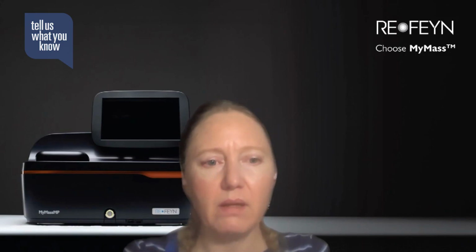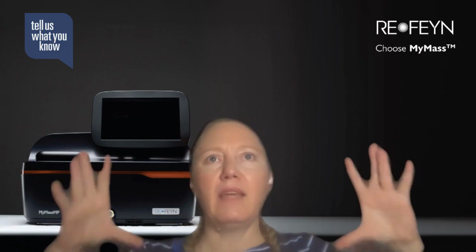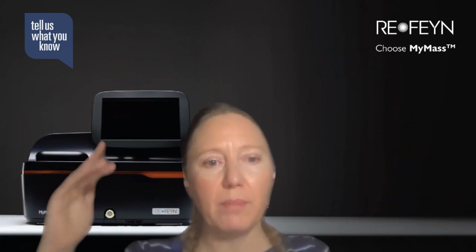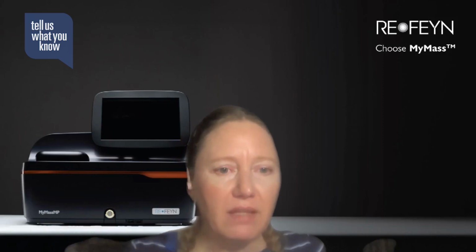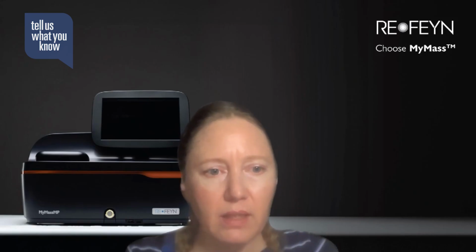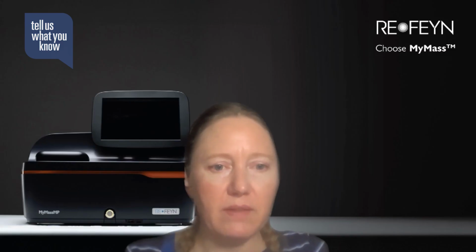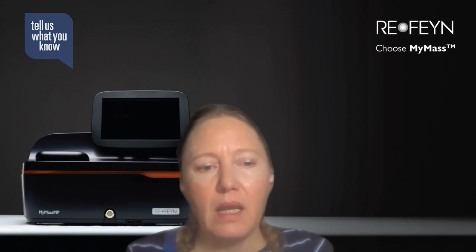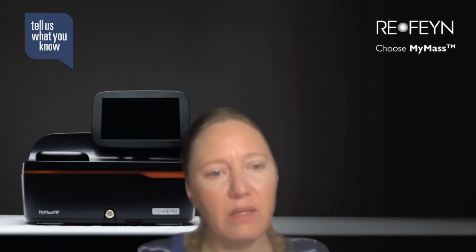So I think this is where fast, low sample consumption experimental checks become really important. So AI can give you a whole list of candidates, and then it can also help you narrow down which are the best ones. But then you need a fast, low sample consumption experimental check to confirm that you've actually had the intended species. So it has the right assembly, it has the right stoichiometry, and it's not aggregating. So once you've made these checks, you feel much more confident to invest in downstream structural work.